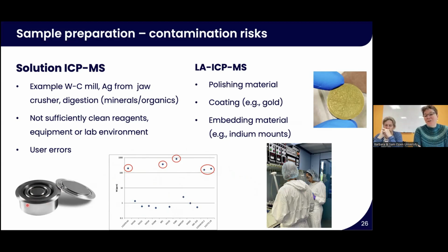So obviously a lot of tungsten had been introduced, and they're not outliers but a result of tungsten milling. And we had similar other things where we suddenly had silver analyses of 10 ppm, which is like, you would start a silver mine if you had that kind of concentration, because usually it's about 30 ppb.